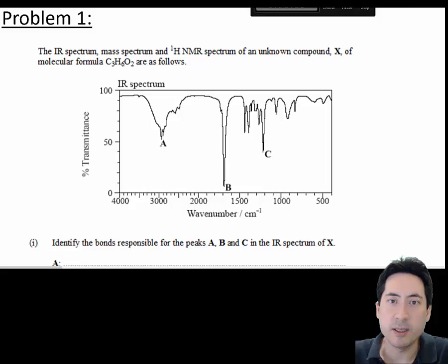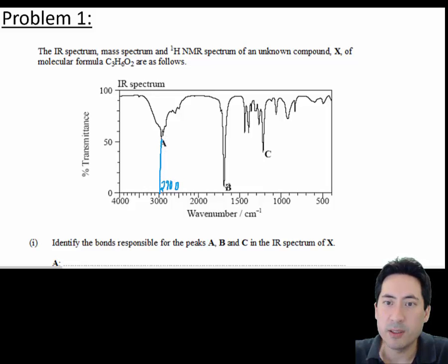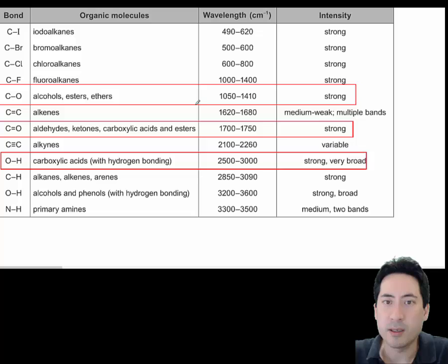Problem one now, we're just going to look at the infrared spectrum here. So the infrared spectrum of an unknown compound X of molecular formula C3H6O2 is as follows. Identify the peaks, the ABC peaks. So we just draw lines down from there and we get 2900, 1700 and 1200. And so we go to the data booklet and we can see the possible choices here.